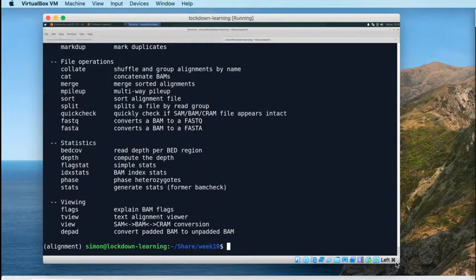At the heart of what we want SAMTools for, right now anyway, is converting from a SAM file to a more compressed representation of the data. Like applying gzip compression to a FASTQ file, we want to be able to reduce the amount of space that our SAM file occupies on the disk.